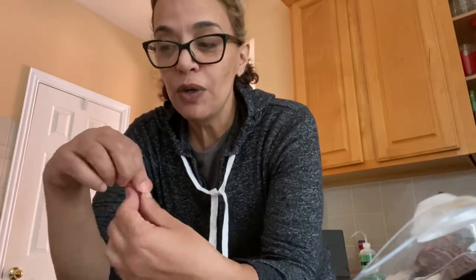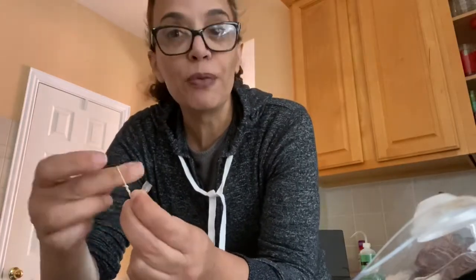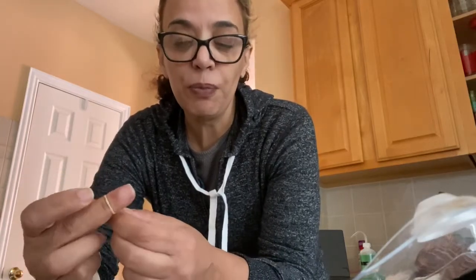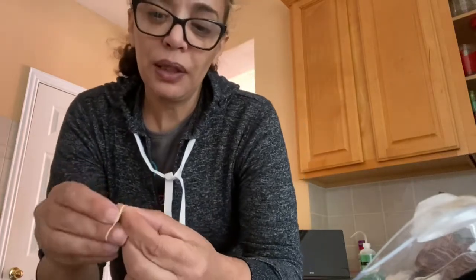Okay, I will take my bag number one, and I am going to put on it 10 milliliters. I will rub it on one side, right? And then we'll put on it 10 milliliters of 1% sugar. I will come back to you later on when I prepare all my bags.